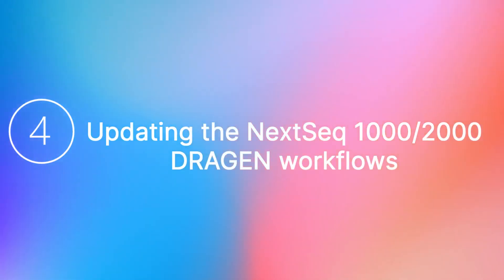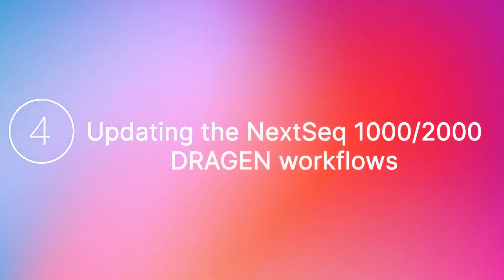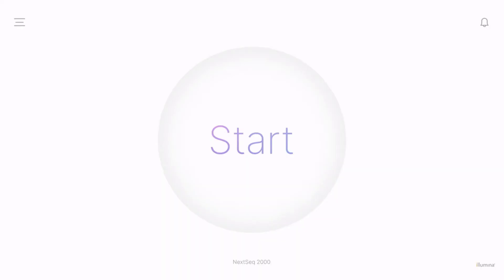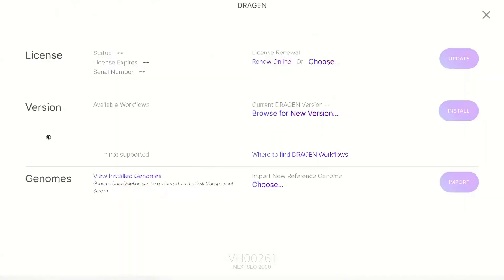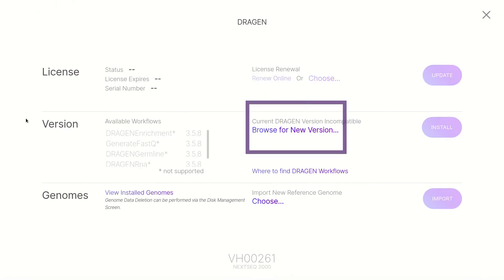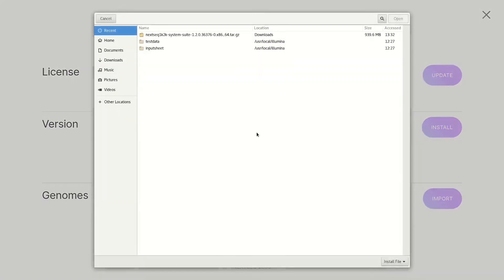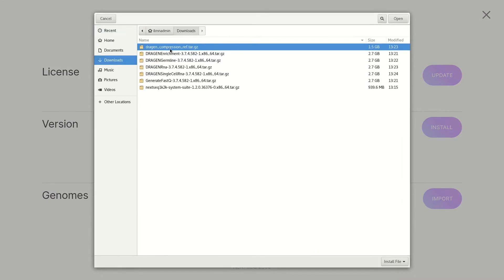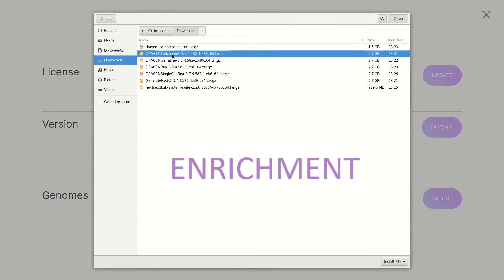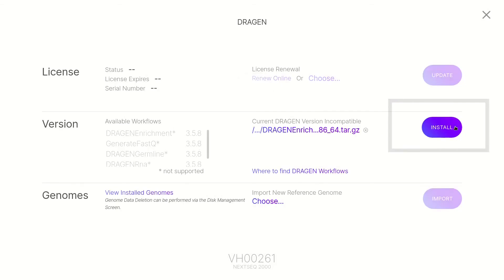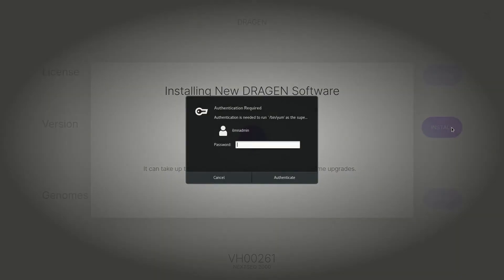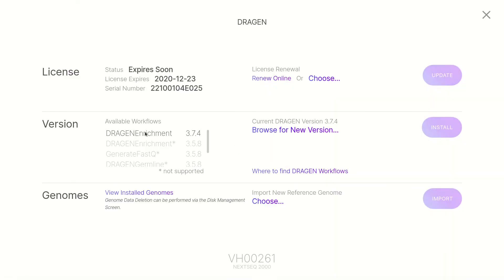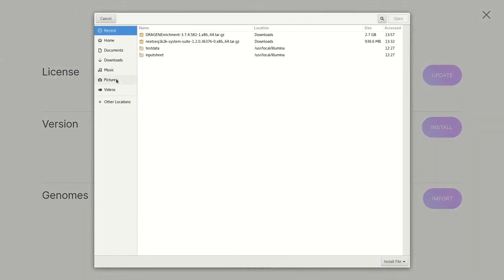Step 4: Updating the NextSeq 1000 and 2000 DRAGEN workflows. From the Control Software home screen, select the menu icon in the top left corner, then select DRAGEN. In the Version section, select Browse for New Version. In the Browse window, navigate to the folder location with the workflow downloads and double-click the DRAGEN Enrichment file. Next, click Install. If an authentication required box appears, type in your Illumina Admin password and select Authenticate. Repeat the preceding steps until each downloaded workflow module is installed.